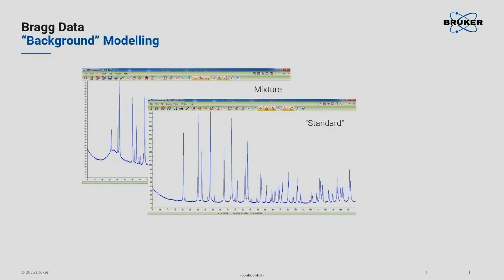And the second is, if you take the sample holder out, and this is obviously true for reflection instruments, you will illuminate the instrument much harder. And I mean here, if there are any instrument parts made out of iron, you can imagine what happens. So yeah, you could do that, but if you do that, try to do it a little bit systematically.